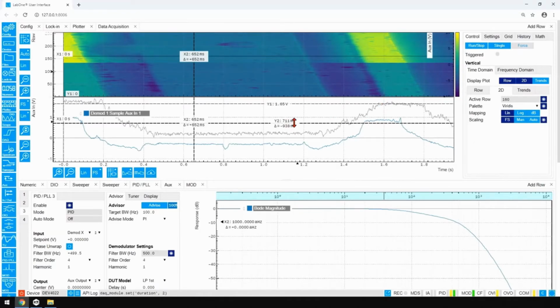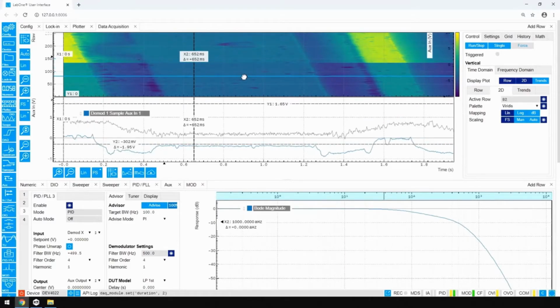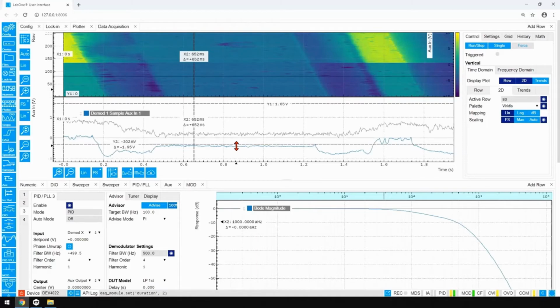Another important thing that we can notice from this graph is that if we look now at the baseline, so if we sit on the aluminum electrode instead, on this one, there was no bias neither before nor after, because this is grounded. So we see that there is actually a slight offset in this mode, of about 100 millivolts. So between, let's say, this and here.